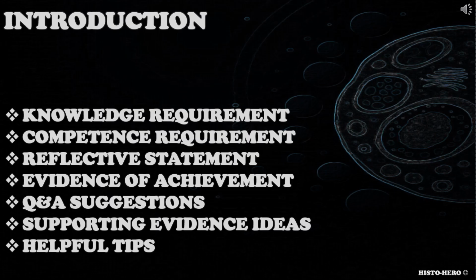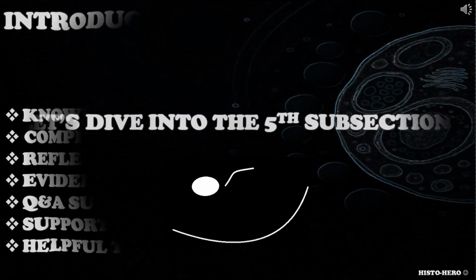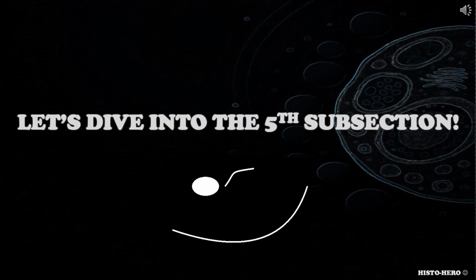I will discuss knowledge requirements, competence requirements, reflective statement, evidence of achievement, Q&A suggestions, evidence ideas, and some helpful tips to make candidates' portfolio really good. With all that said, I hope you will enjoy the content of my video and I hope you will learn a lot. So let's dive into the fifth subsection of the first section: tissue preparation techniques, microtomy.